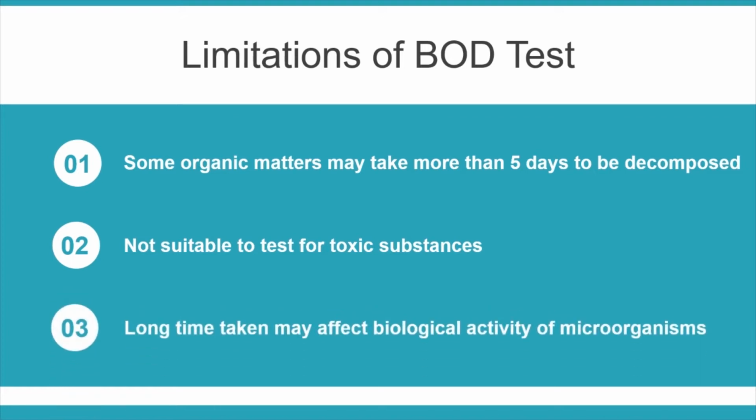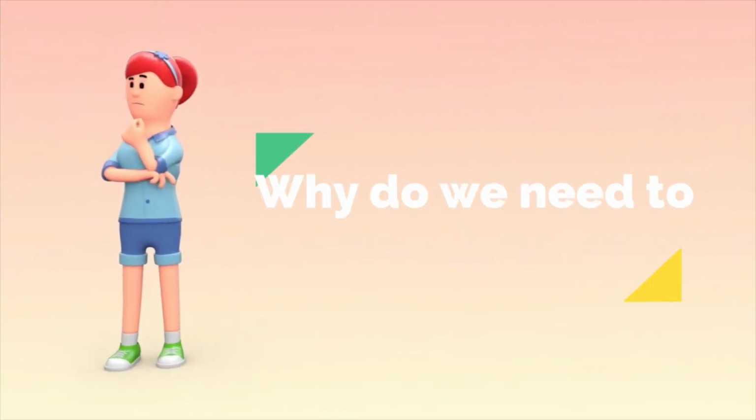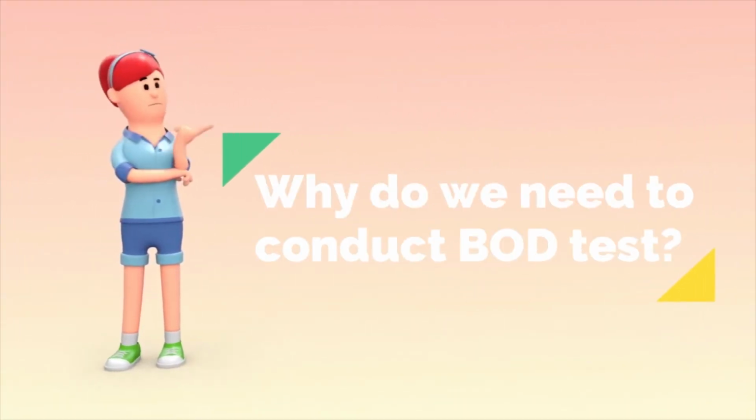Lastly, the time taken to measure the BOD is too long. In these 5 days, the pH value may drop and the nutrient supply may be insufficient for the microorganisms to survive for 5 days. Thus, the amount of microorganisms existing is limited. Why do we need to conduct BOD tests?